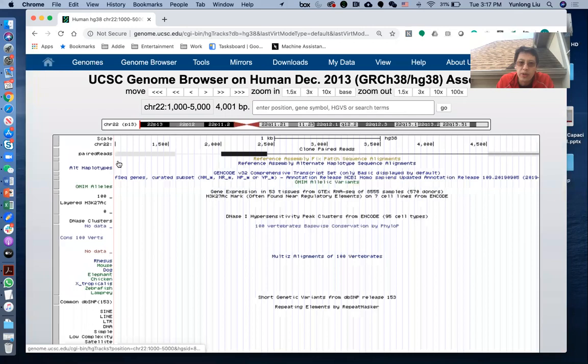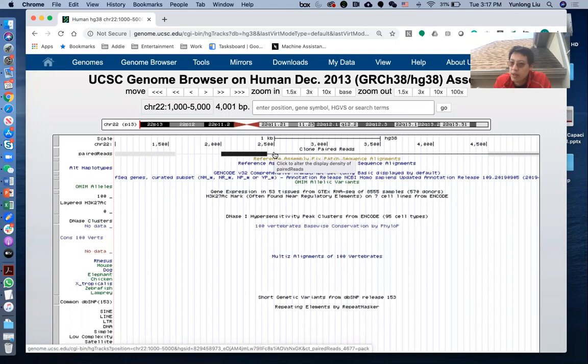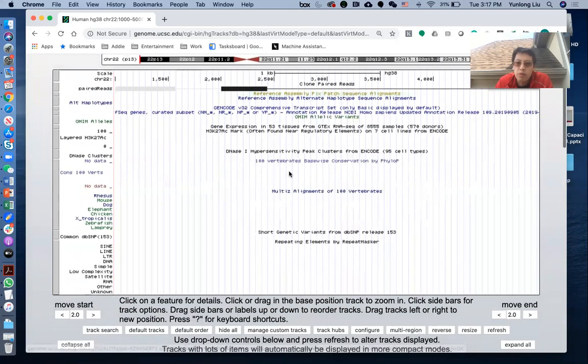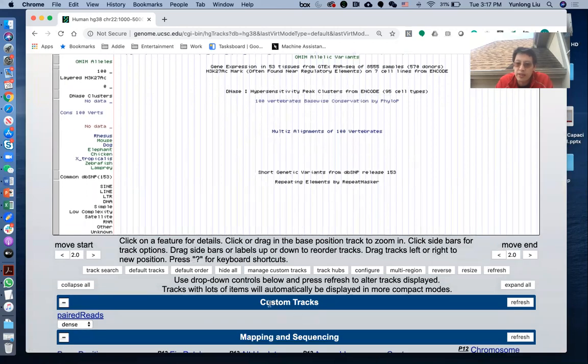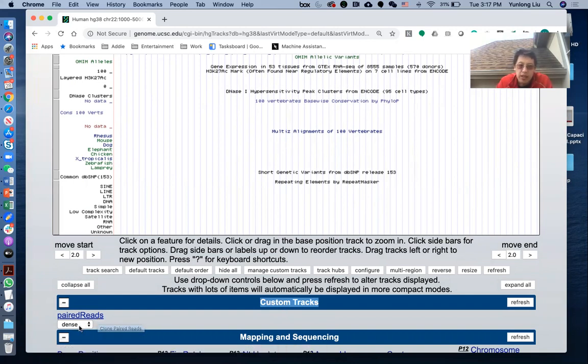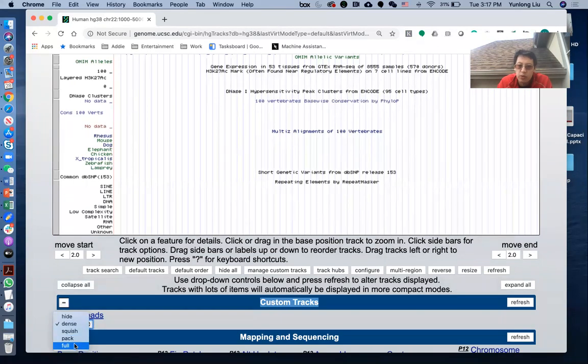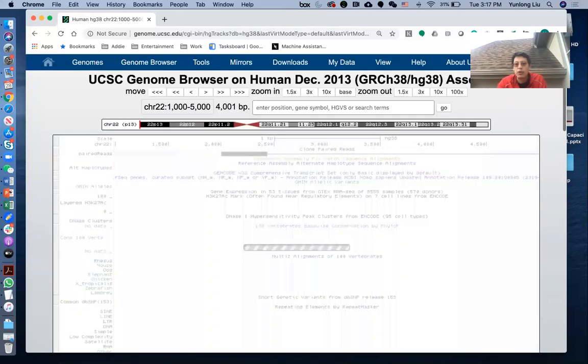So you are now seeing one more track. You can see one section that was not there before. If you move this over, you can see there's one section called custom tracks showing here. This is the track, the name that you put in. So now you see this viewing session, the mode is dense. You can click that into full, for example. You can try different ones and have appreciation of what they look like. Then you click Refresh.